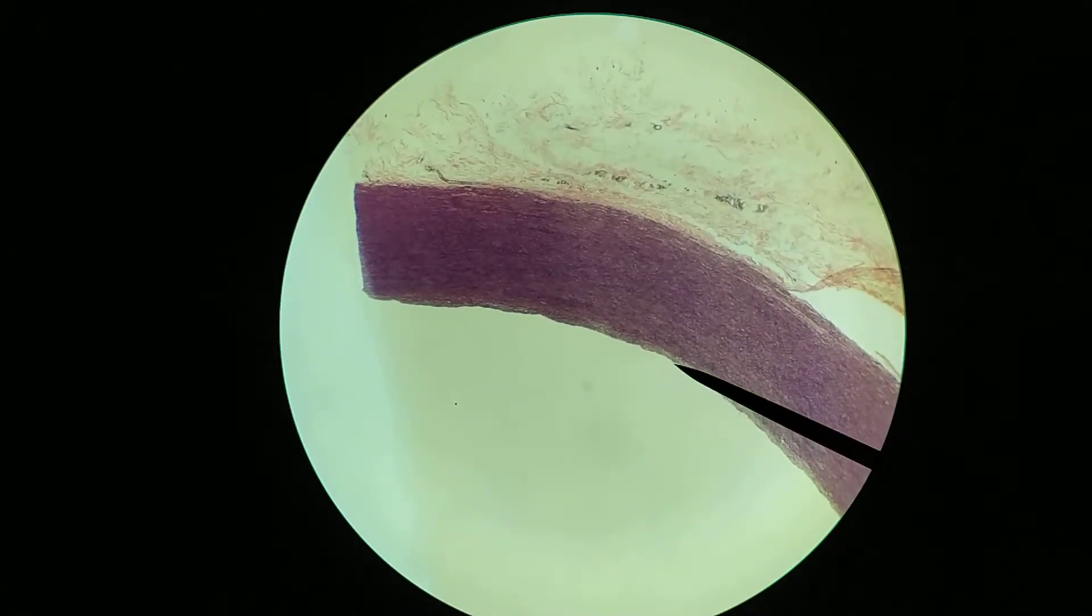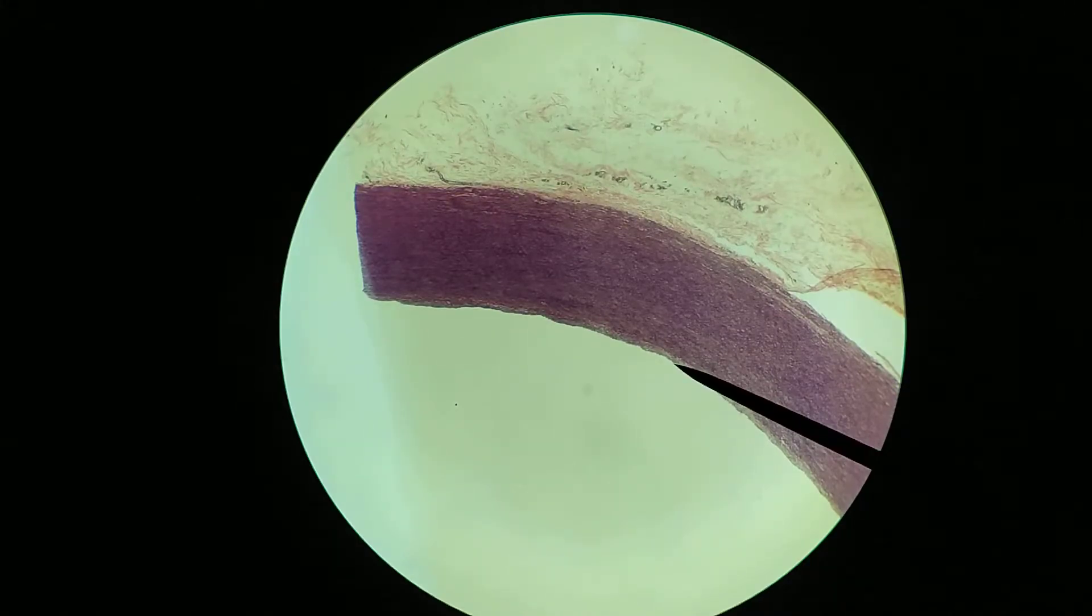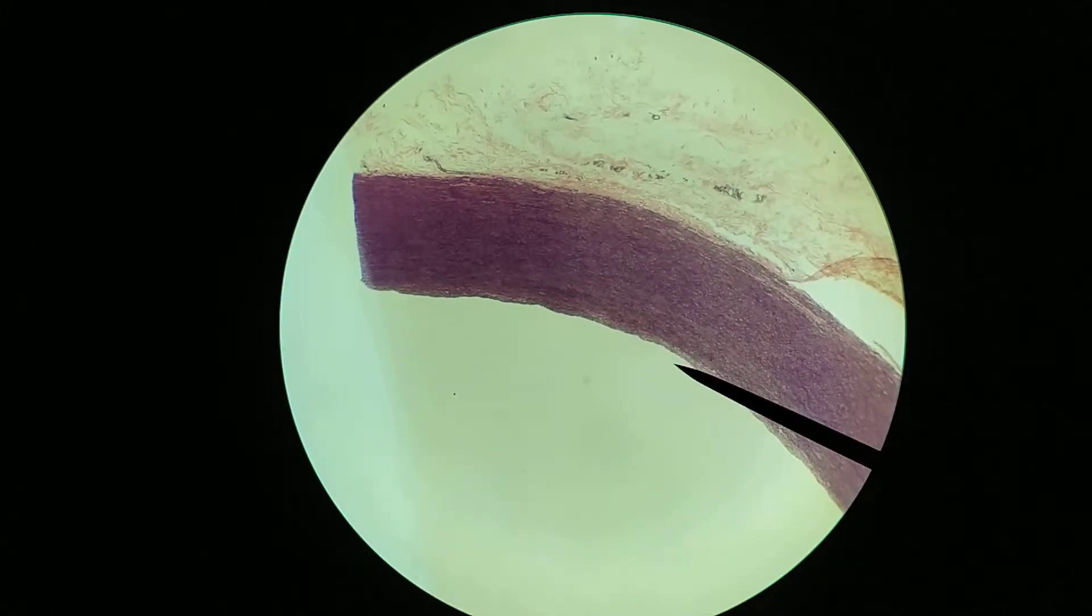And as you might recall, we have three layers in a typical blood vessel. We have the tunica intima, tunica media, and tunica adventitia. So let's go through these in detail, or in turn rather.